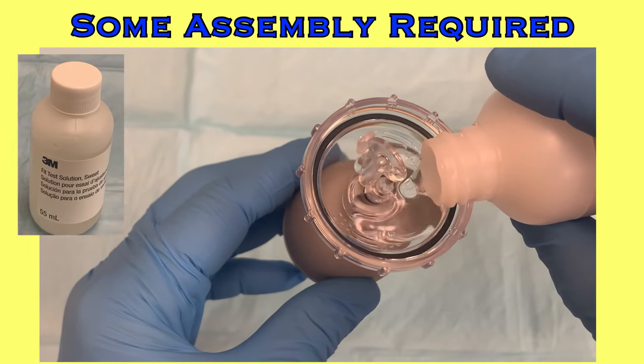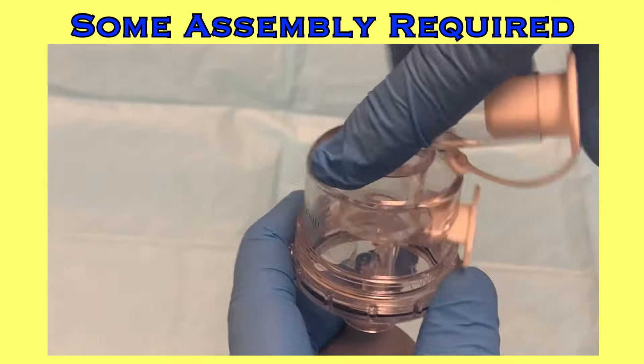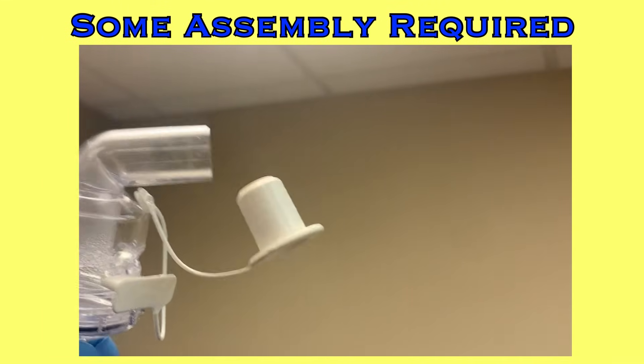Next, fill the second nebulizer with the black fit test solution. You will use more of this solution than the sensitivity solution, but a little still goes a long way. Attach the nebulizer top with the black labeling to this nebulizer, then test that the nebulizer is working before proceeding.